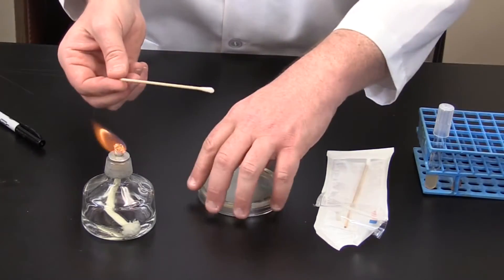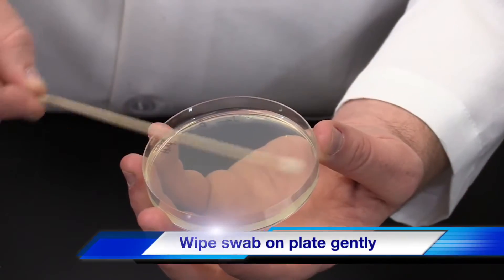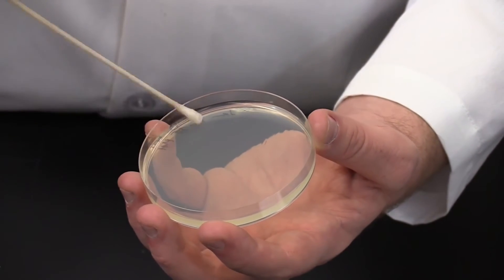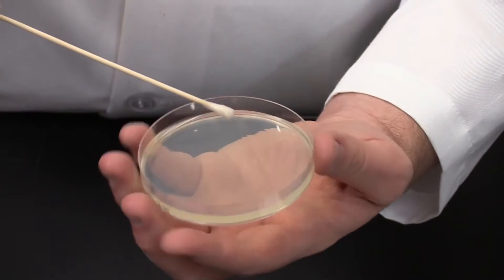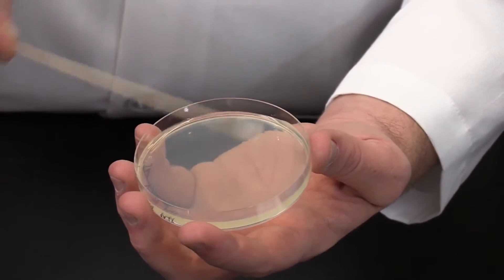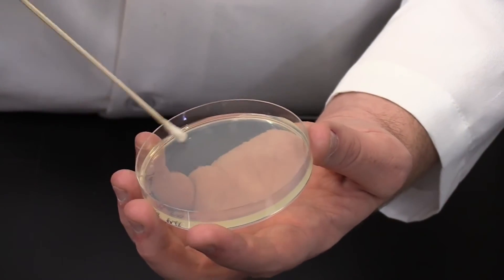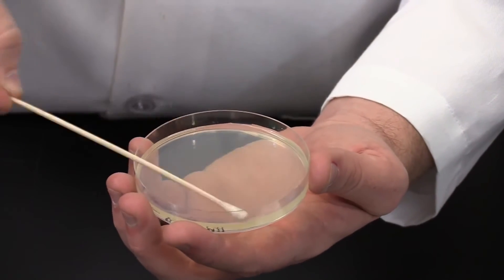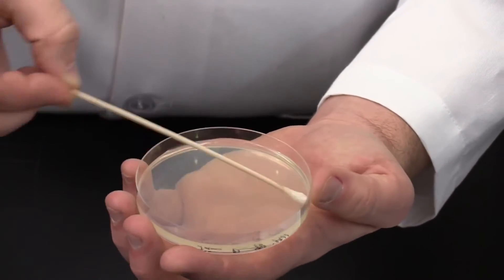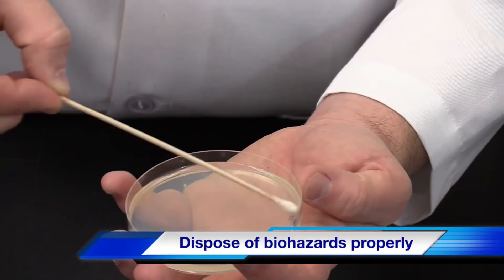Next, pick up the plate and using the swab in a side to side motion, swab the plate gently. The idea is to create a uniform layer of bacteria. To do this, slightly rotate the plate twice. When the entire surface of the plate has been covered, dispose of the swab in the biohazard container.